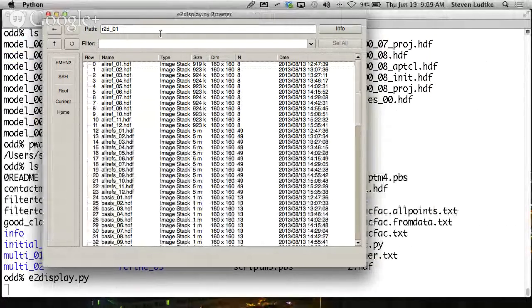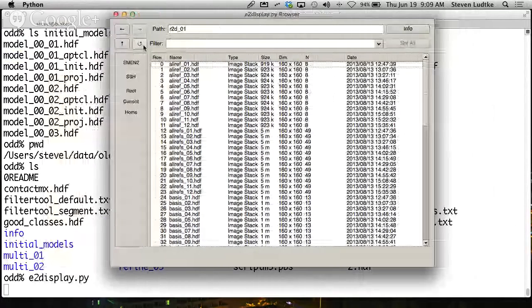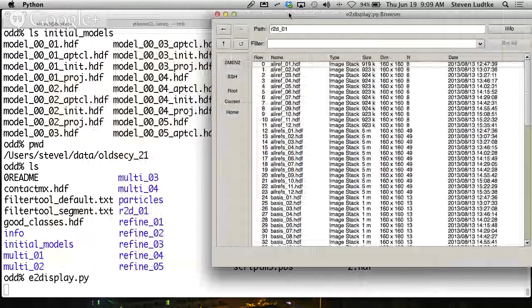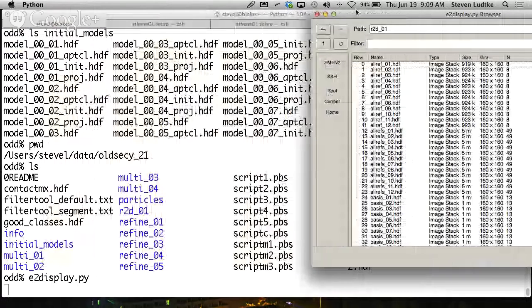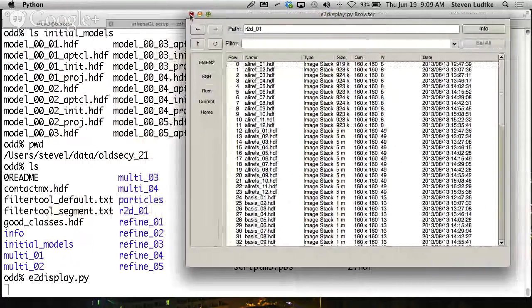All right. I'm going to go ahead and pick up with the R2D directories. I'm sure at least a little bit of what I said before had been recorded. So once again, what we're doing today is we're going through all of the different subdirectories that exist and all the files that exist in the various subdirectories after you run the normal EMAN2 refinement programs and looking at what the various files are.